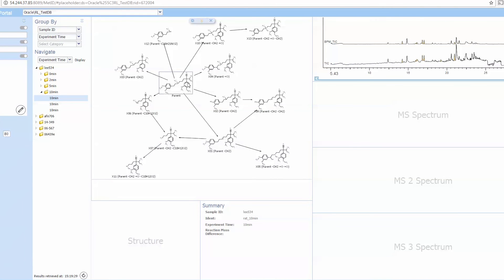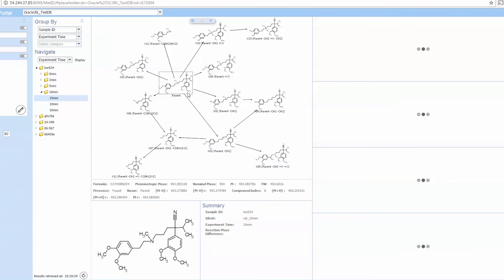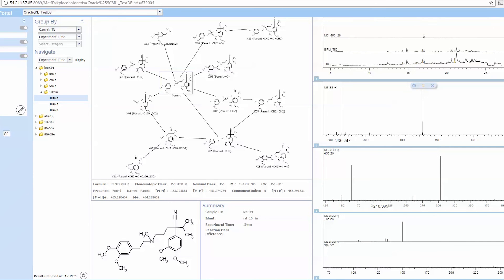The biotransformation map is completely interactive. So, as you click on an element in the biotransformation map, the associated spectra, whether MS 1, 2, or 3, are fully visualized, along with any metadata.